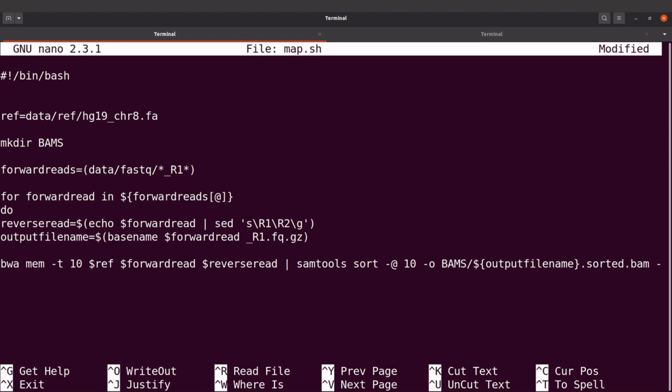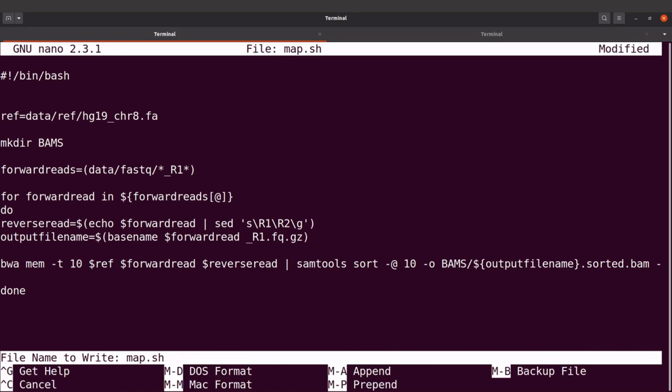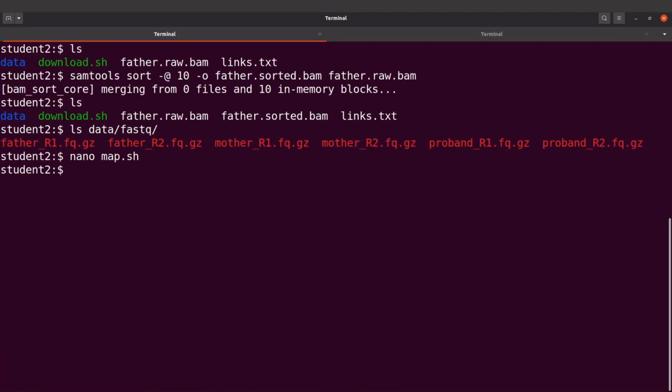So now we can say done. And then we can exit and save the changes. And by the way, I'll make this script available so that you can use it without having to type everything. So everything is attached to this video. I'll just save the changes, and then that is it.